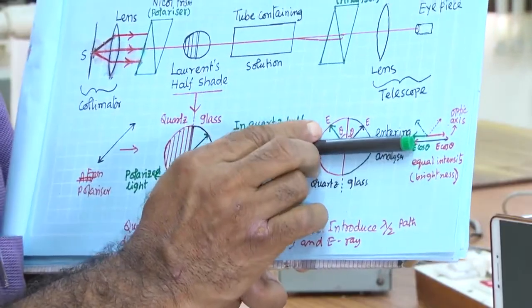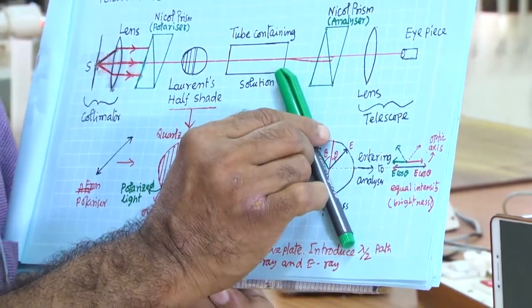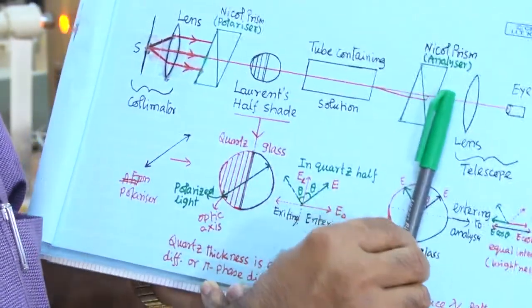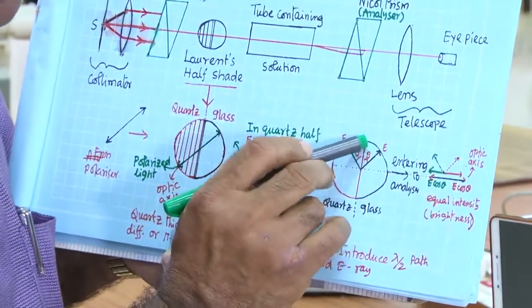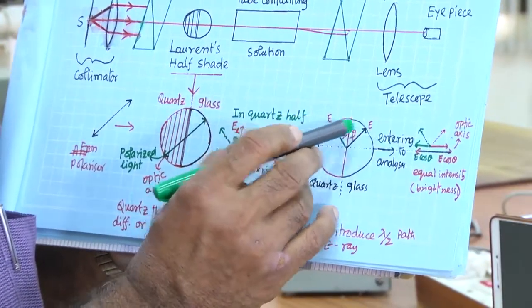So, from equal intensity, the next stage I got is this one half is bright, one half is dark. Then if I continue the rotation, I will get this position, optics axis. In this position also you will see this equal angle of this electric component in both halves.